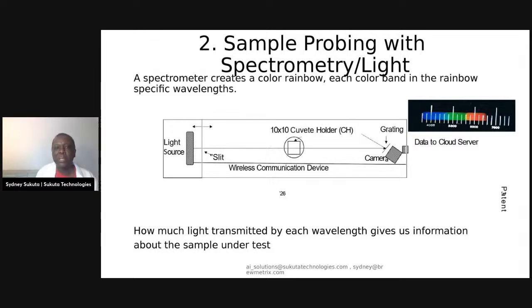So what we normally do is we shine the light without a sample, so we have a background, right? And then we shine the light with the sample. Now, when we compare the original light that we passed without the sample and the light we get after the sample, how much light is transmitted through each wavelength gives us information about the sample. And then the AI takes over. So this is the rainbow created. Think of a spectrometer as something that makes rainbows. And if the light is intercepted by a sample as it goes through it, it's going to collect information about that sample. And then it's now available for us to analyze.